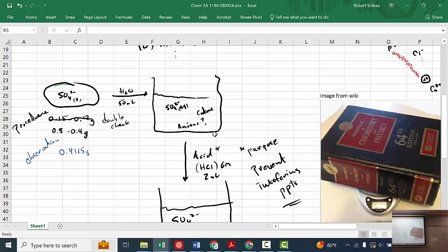Now this is a special bottle. This is called a weighing bottle. And a weighing bottle, do you see the top here? That's machined. This is called ground glass. And we have a ground glass here, and this is called a ground glass joint. It's a very tight joint. In fact, it could get stuck. And so what we're going to do, and we have enough desiccators, is we're going to cool down. Actually I'm going to cool down the whole thing.